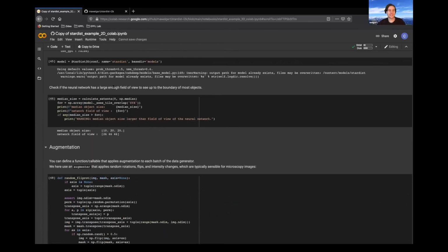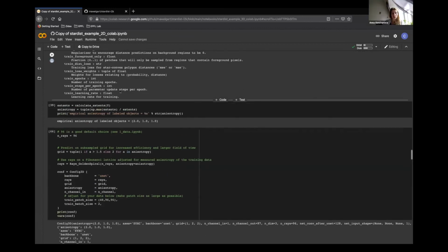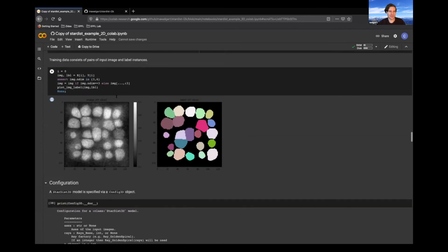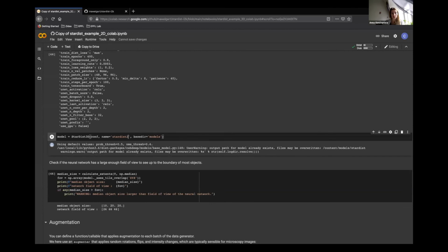Because it could be, that's actually an interesting point. I think this sometimes can be problems with the NMS if you have too many candidates. If you have like 1 million candidates per tiny crop, then 1 million neighboring intersection tests will be done, or actually not 1 million, but 1 million log 1 million. So that can be quite the bottleneck sometimes. I can share the screen briefly, if I can.